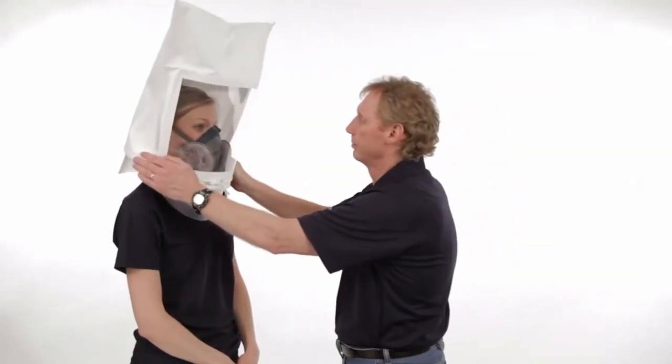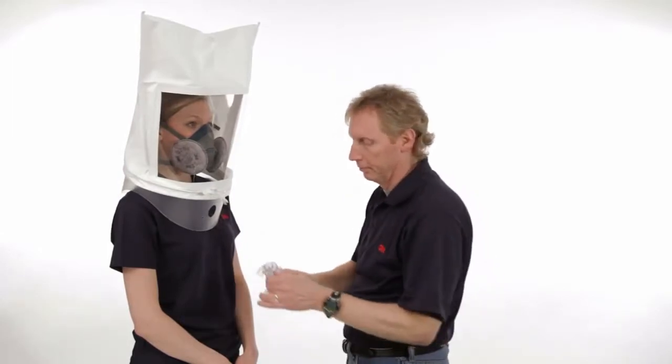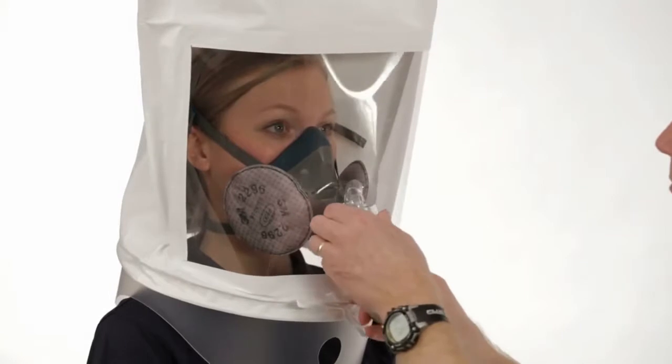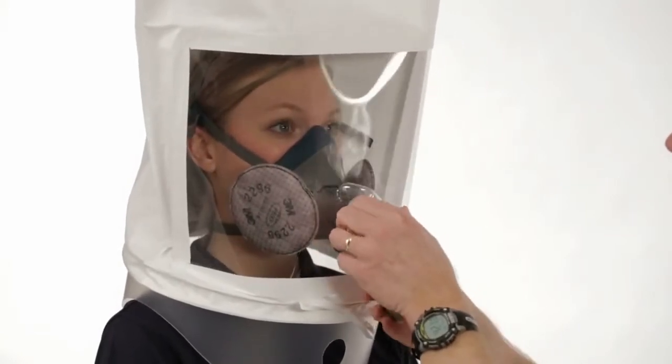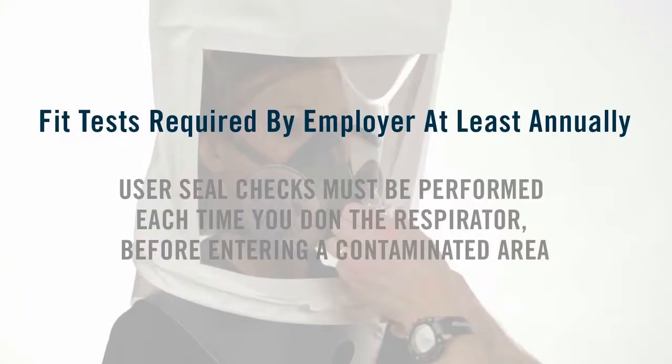In the U.S., OSHA, the Occupational Safety and Health Administration, requires fit testing to ensure that your respirator fits properly. It is your employer's responsibility to ensure that you receive a fit test when the respirator is first issued to you, and then at least once a year. You will only get the protection this respirator can provide if it fits you properly and you wear it at all times while you are in a contaminated area.